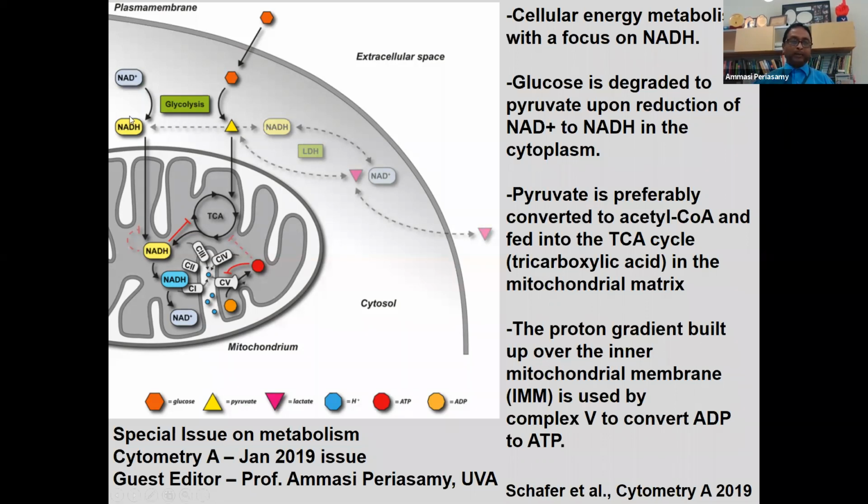So ATP is the energy source for the cells. I am going to talk mainly on the NADH measurement for drug response in prostate cancer cells, as well as for the leukemia cancer cells, and how we developed a new idea of implementing that data analysis.